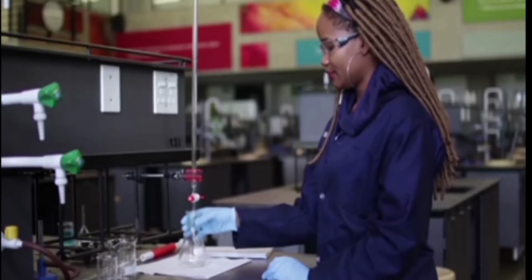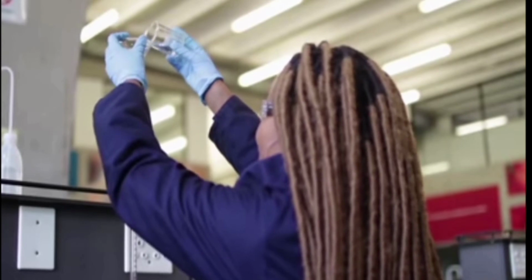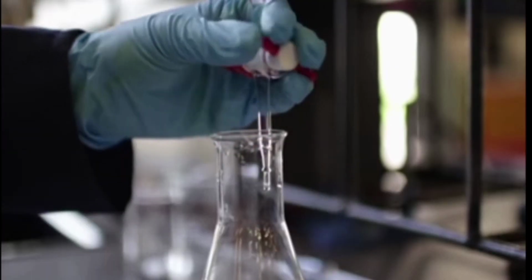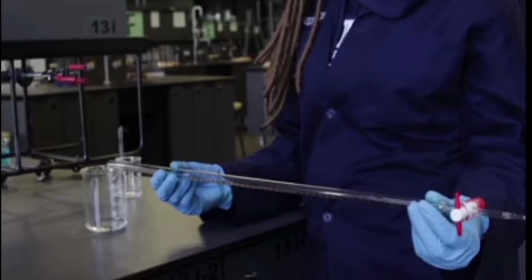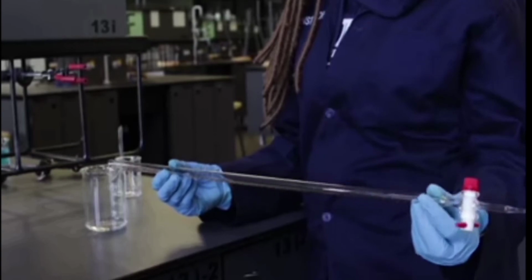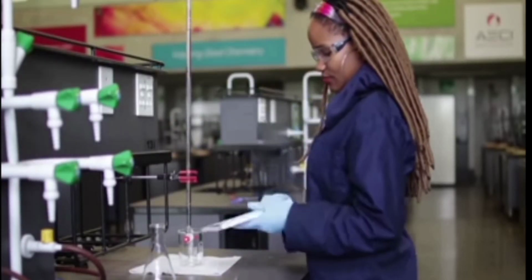The accuracy of the results of your titration will be a reflection of the care you took while performing it. When done carefully, titration gives very accurate, precise results. Here is a step-by-step procedure required for performing a successful titration. The burette has now been cleaned and prepared as shown in the previous video. The meniscus is level with any graduation mark on the burette between 0 and 2 milliliters.